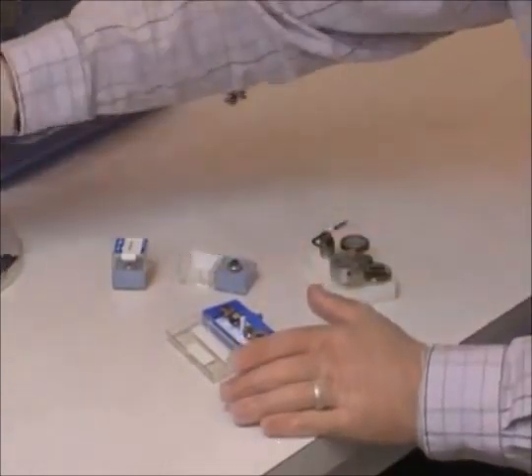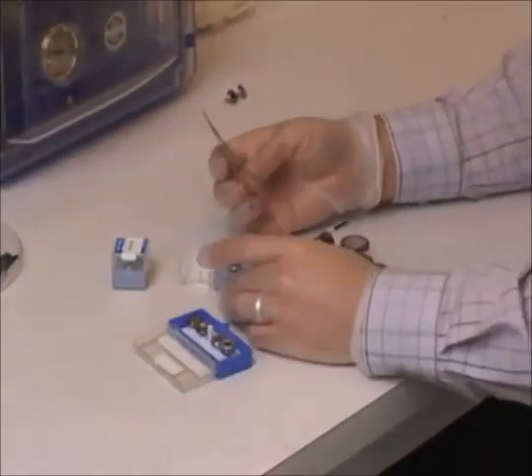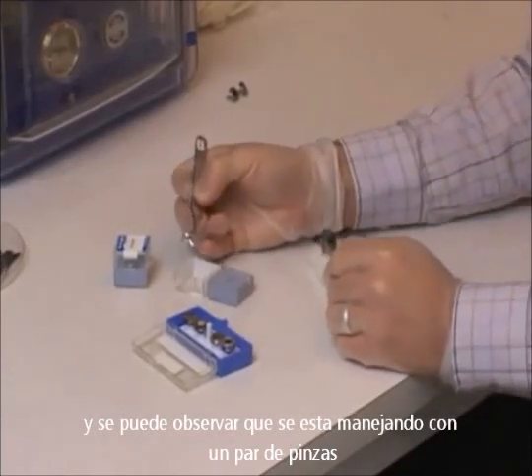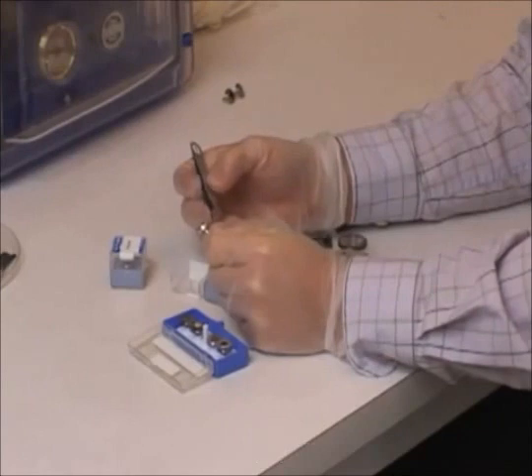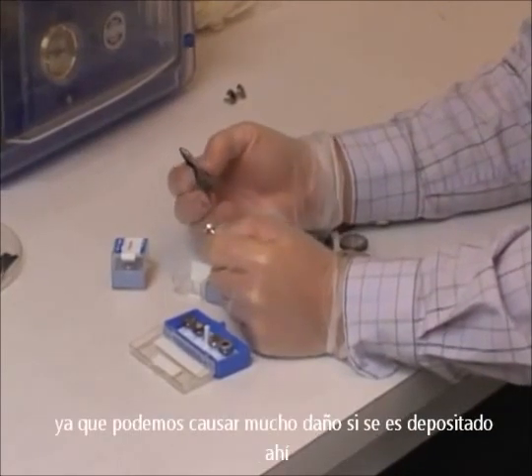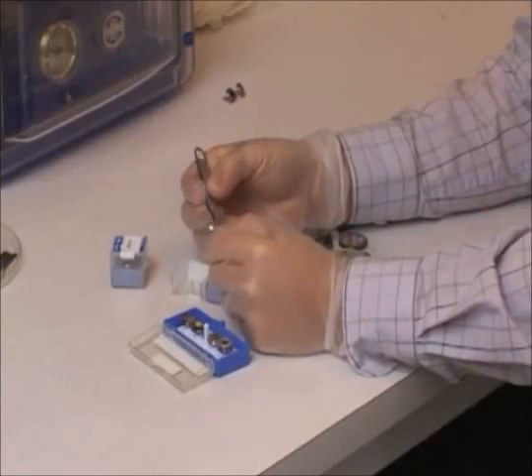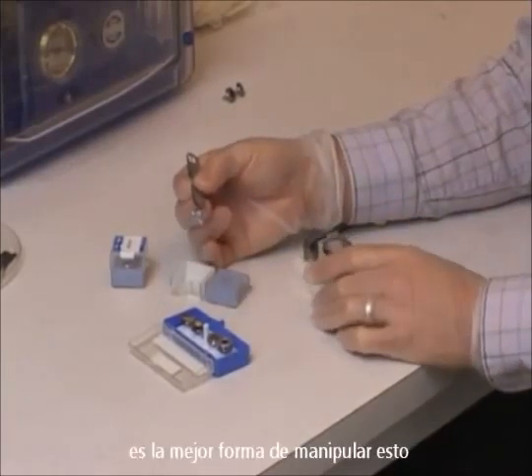Gold nanoparticles on carbon give you very high contrast, so they're good for looking at the resolution limit of the microscope. You can see that I'm handling it with a pair of tweezers. Each sample has a small groove in the side. If we were to actually touch the surface of the sample, we would cause a lot of damage to the thin film that's deposited there. So in order to avoid damaging the sample, handling with these tweezers in the groove on the sample holder is the best way to manipulate these.